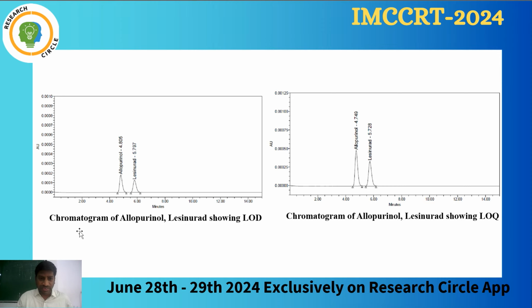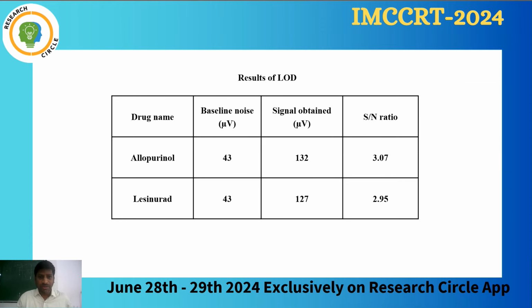We got these chromatograms. In the results of LOD, the signal to noise is better. So this method is able to detect the least quantity, as well as quantify the least quantity also.